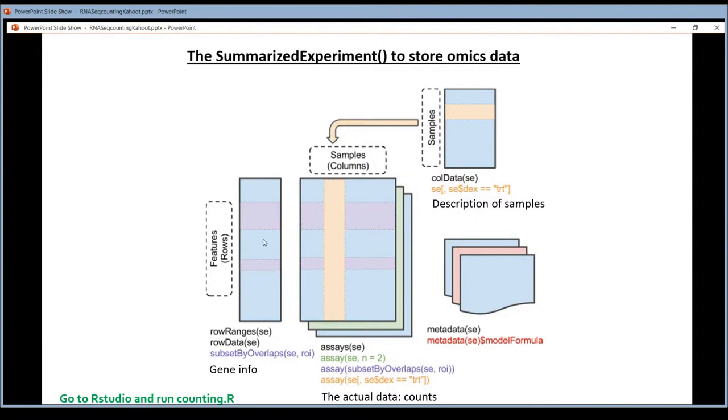And that row will be removed from the gene annotation data frames. And you don't have to keep track of it yourself, which is very helpful. It would be hell if you were responsible for doing that. So it has big benefits using these more complex data types.